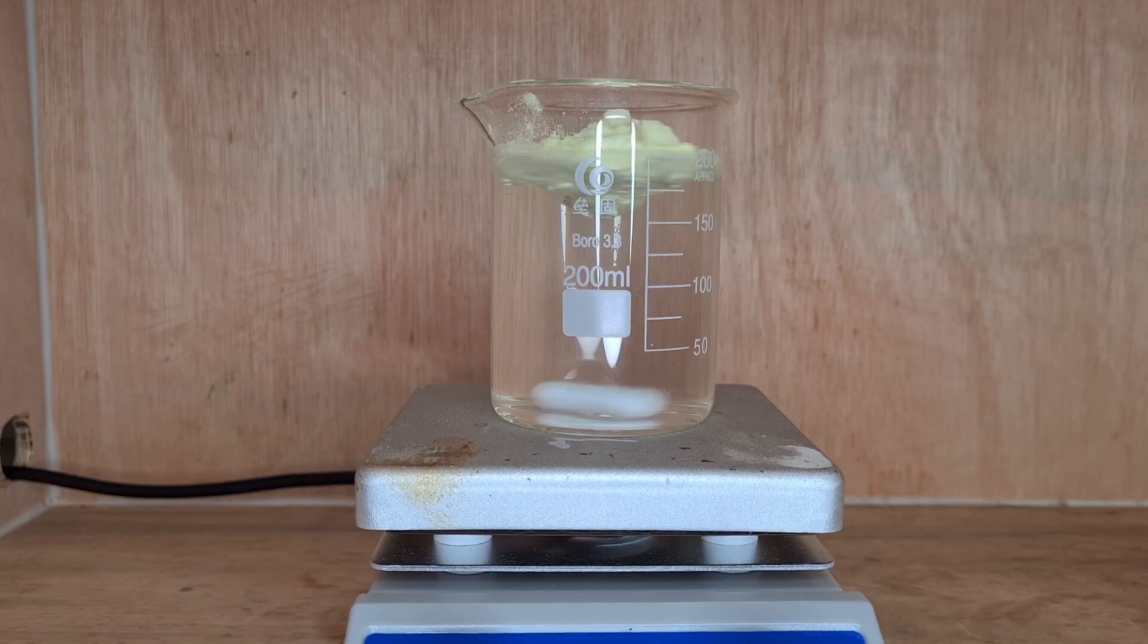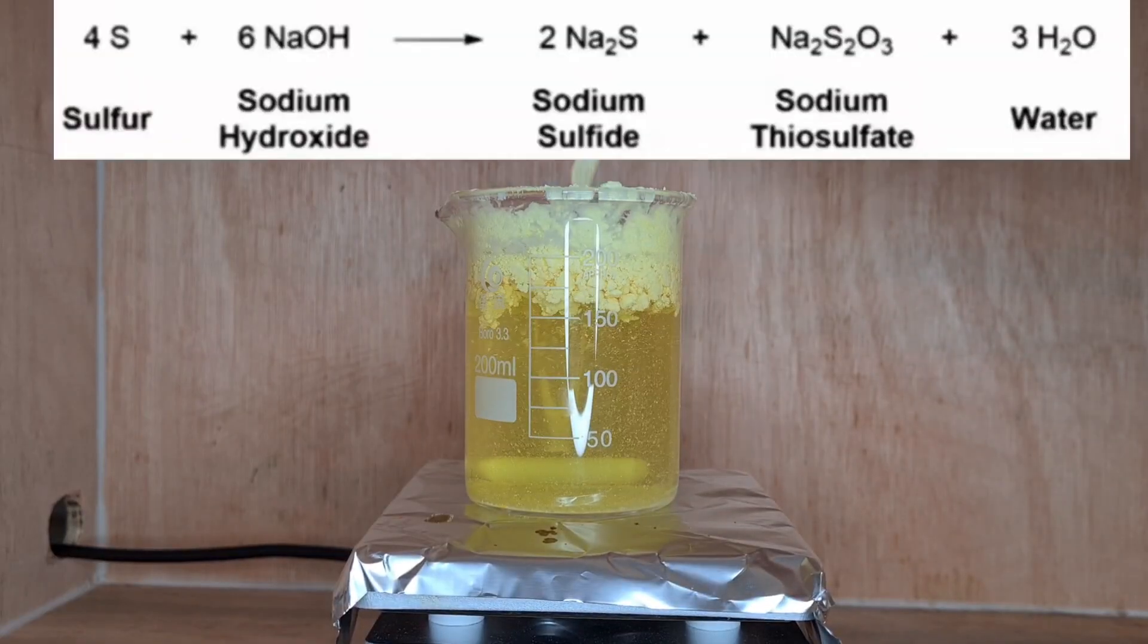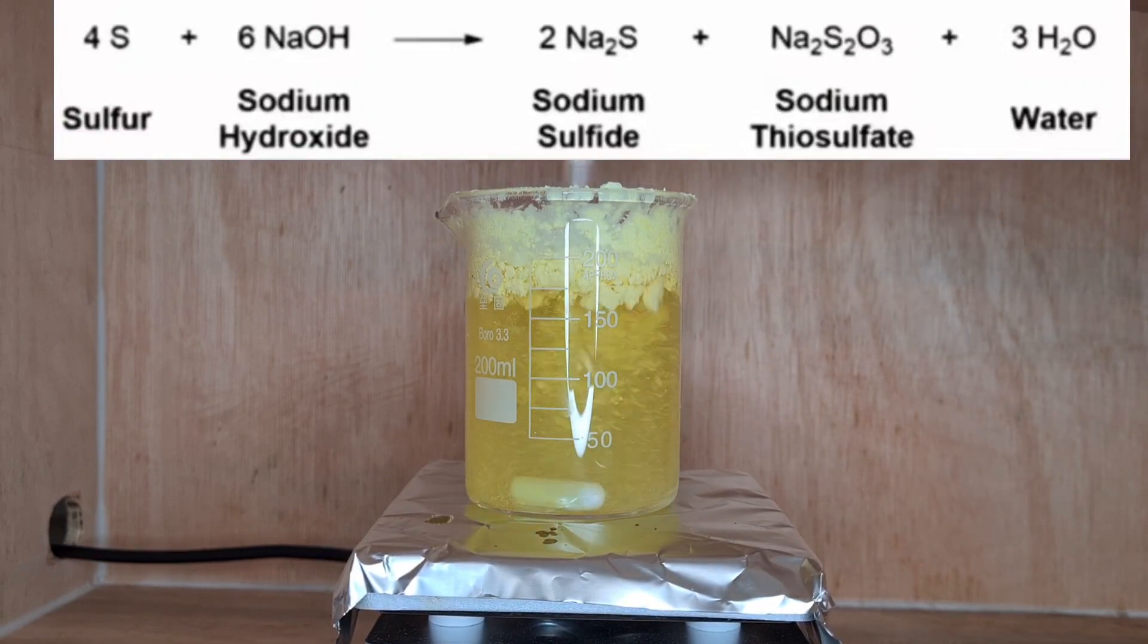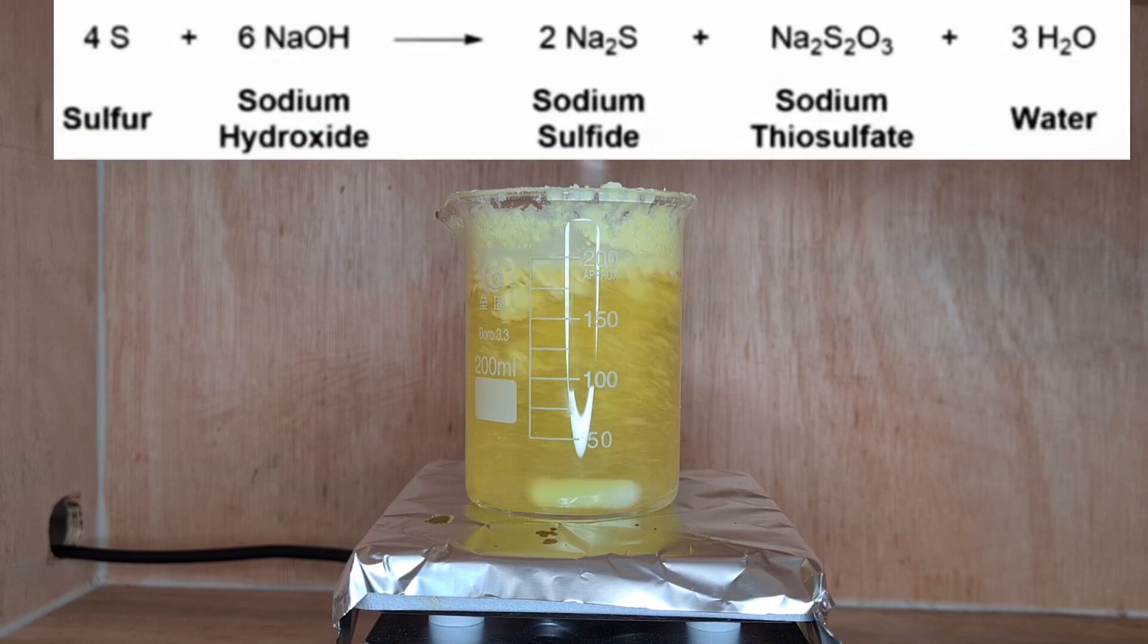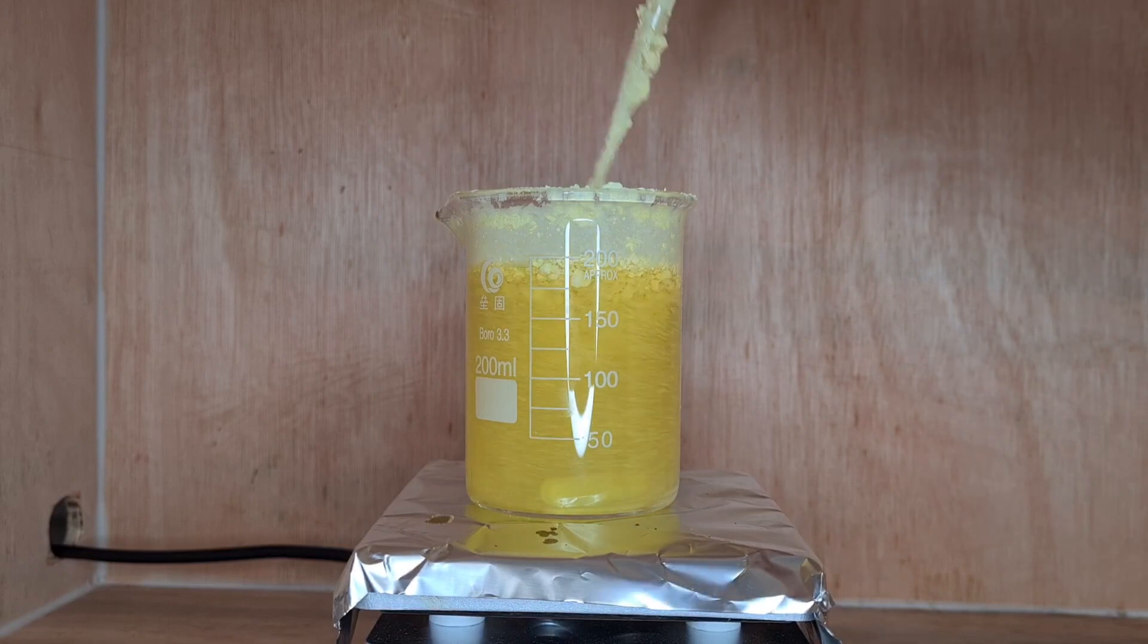Anyways, the sulfur kind of just floated on top and it was pretty annoying. Eventually the sulfur starts dissolving in solution, forming sodium sulfide. However, sodium sulfide is clear and this yellow color is actually from some polysulfides forming. One thing I forgot to mention is this reaction also forms sodium thiosulfate, and that's just an impurity.